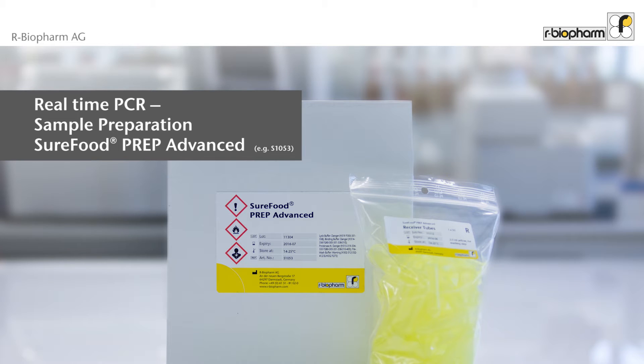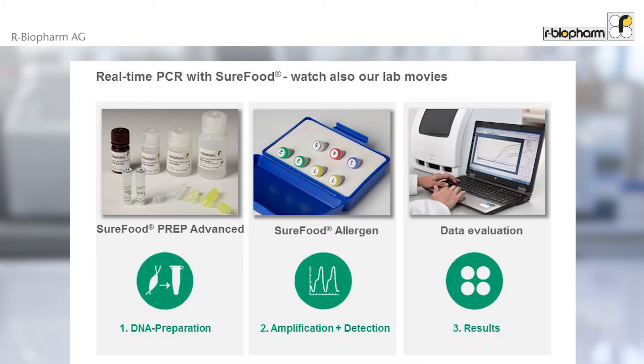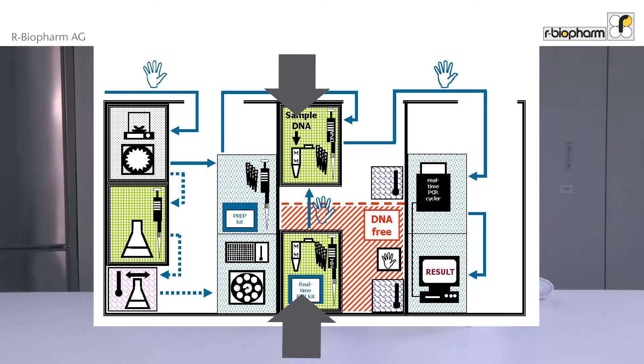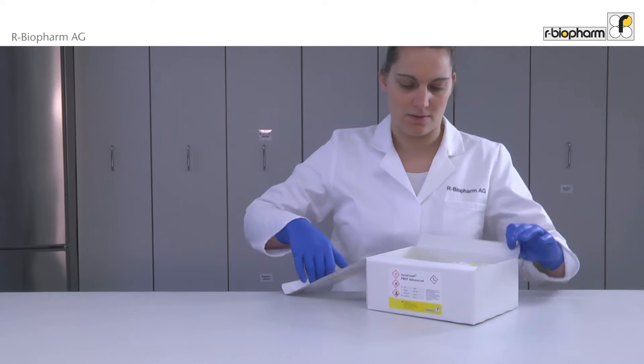Real-time PCR – Sample Preparation using SureFood Prep Advanced. In this video, the PCR sample preparation using SureFood Prep Advanced is shown. Real-time PCR using SureFood test kits can be separated into DNA Preparation, Amplification and Detection, and Data Evaluation. This video focuses on DNA preparation using SureFood Prep Advanced.